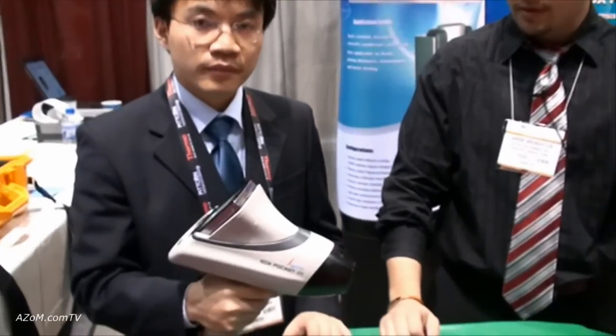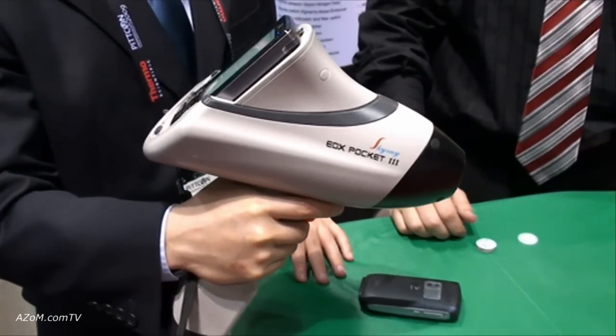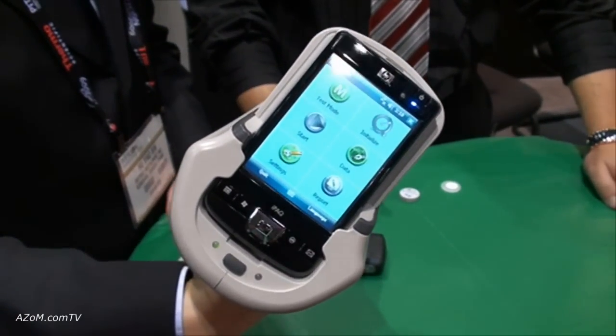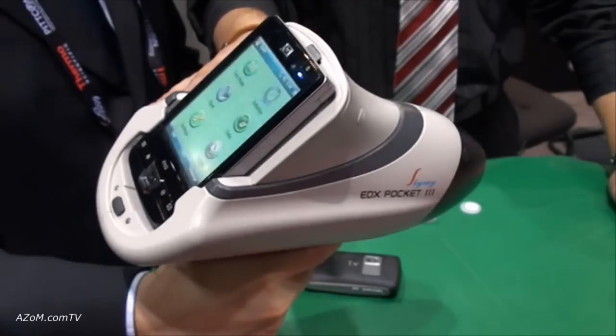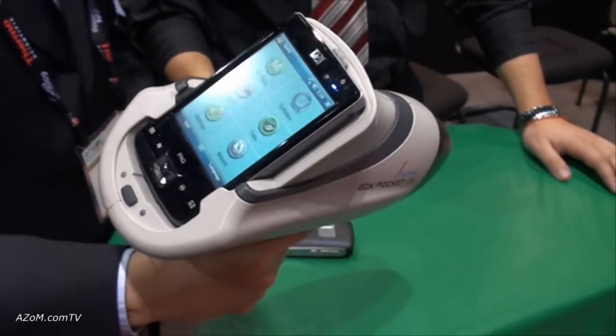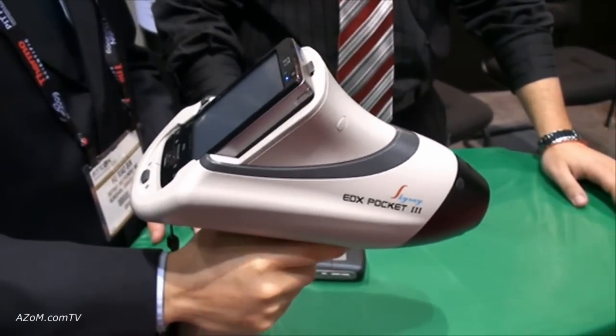Today we're going to be introducing the new EDX Pocket 3 from Skyray Instrument. This brand new handheld X-ray fluorescence spectrometer is equipped with the latest XRF technology. To operate the instrument we use this PDA here. It's wirelessly connected through Bluetooth to the instrument, and you can also set it up to be connected to your computer or printer for real-time results.